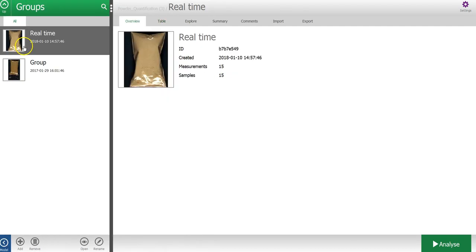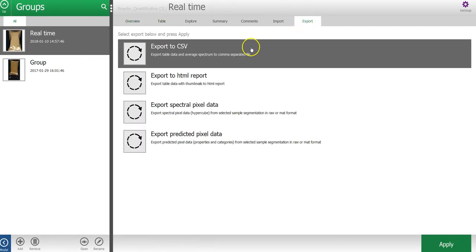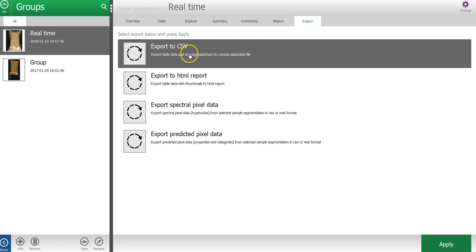In the group level, under the export tab, I can select to export the results from the table to a CSV spreadsheet or to an HTML report.